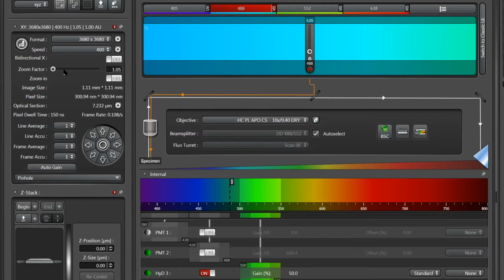You can also zoom out past 1. It can go to 0.75. We started at 0.75 because some of the other competitors had zooms below 1. Our system, you can run it from 0.75 up to, I think, 48 or something. It'll be fine anywhere across the full zoom range.